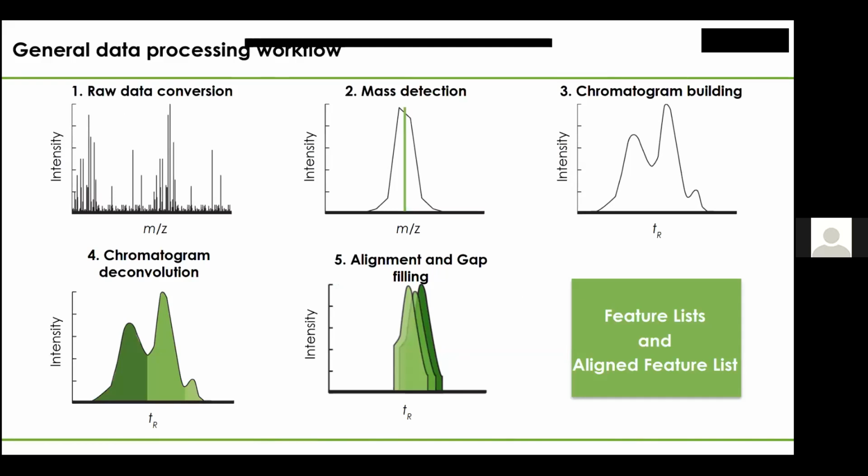So let me briefly explain the theoretical data mining workflow in MZmine. We always start with importing the raw data. But before that, we can think about whether we want to convert the raw data. We have, of course, different vendors, and MZmine supports Thermo, Waters, and most recently Bruker native raw files, but also open formats such as mzML and mzXML, and many more.